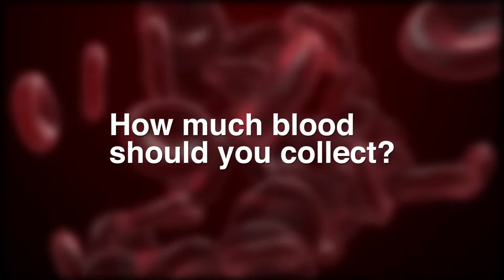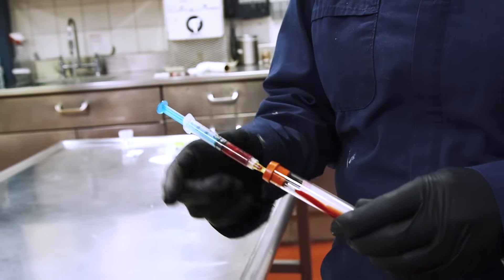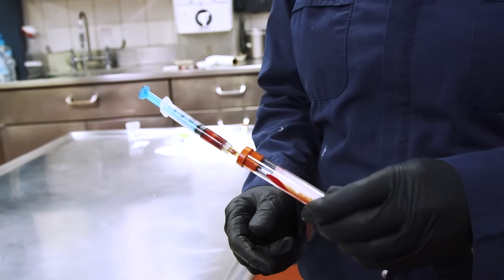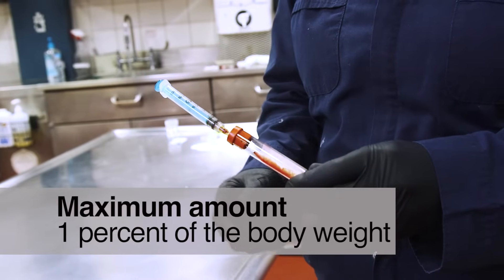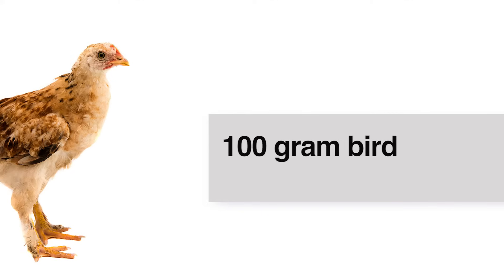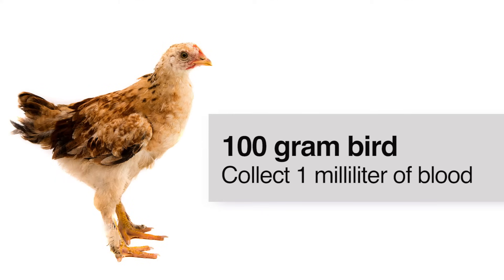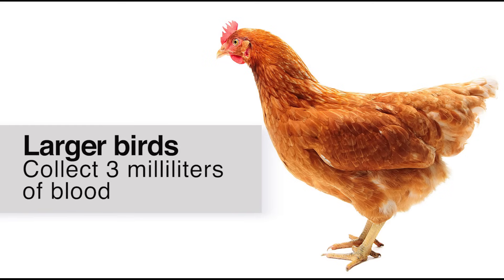How much blood should you collect? Normally, you'll collect 1 to 3 milliliters of blood, which is sufficient to run most tests. The maximum amount of blood you can safely collect from a healthy bird is 1% of its body weight. So in a 100-gram bird, 1 milliliter is all you should collect. However, in birds larger than this, 3 milliliters can be safely collected, which is adequate to run several antibody tests.